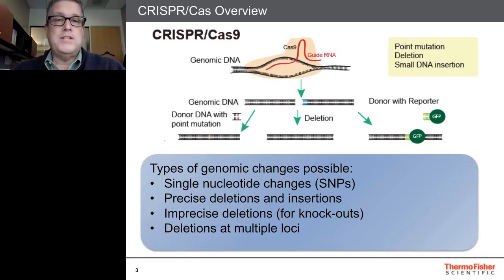Once the nuclease and the guide RNA complex finds the target sequence, a cut is made in the genomic DNA locus that has been targeted, and then that cut genomic DNA is repaired either in a non-homologous fashion, making sloppy changes, or if it's provided with a template, you can make insertions of particular point mutations or GFP sequences, for example, or basically anything at all.